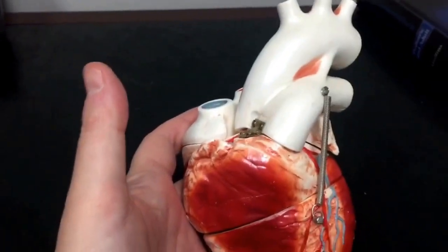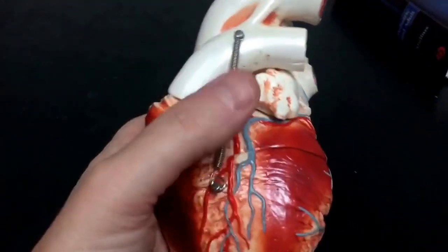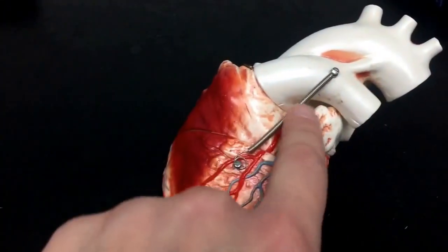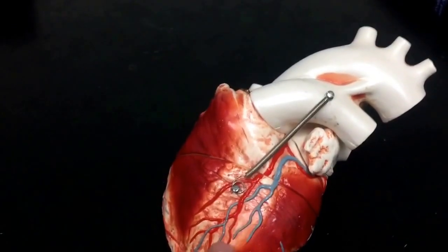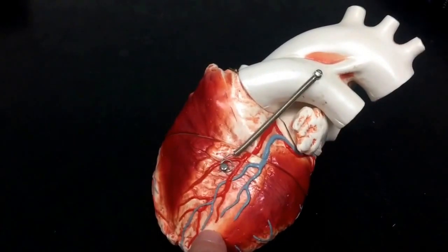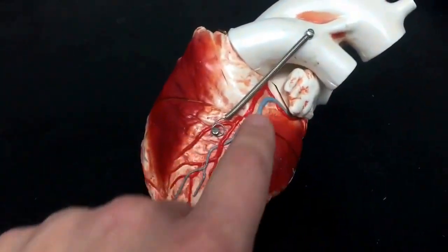So let me point out some of the features externally. You're going to find a groove called the interventricular sulcus on your sheep heart that runs right down along, like a marker identifying the interventricular septum. The left anterior descending coronary artery runs along in this groove.